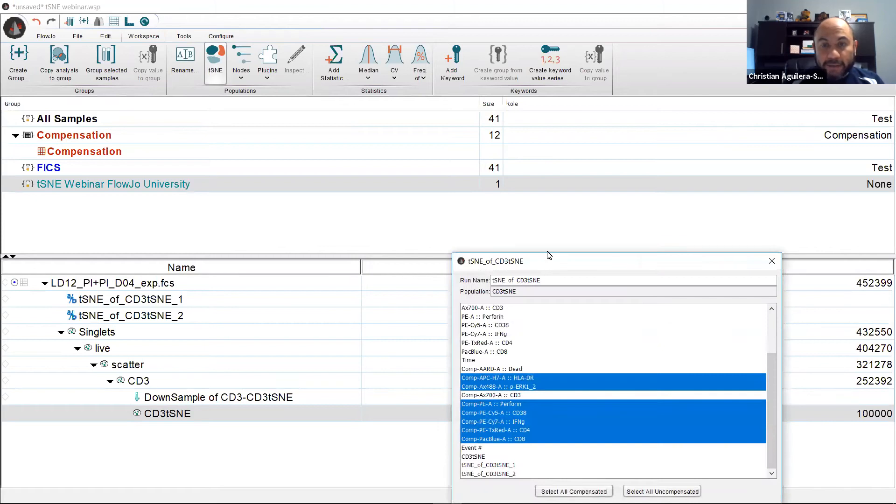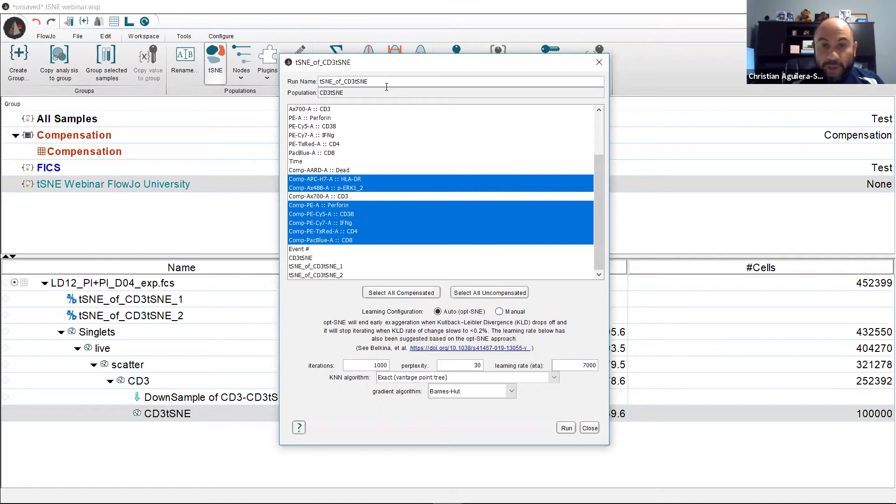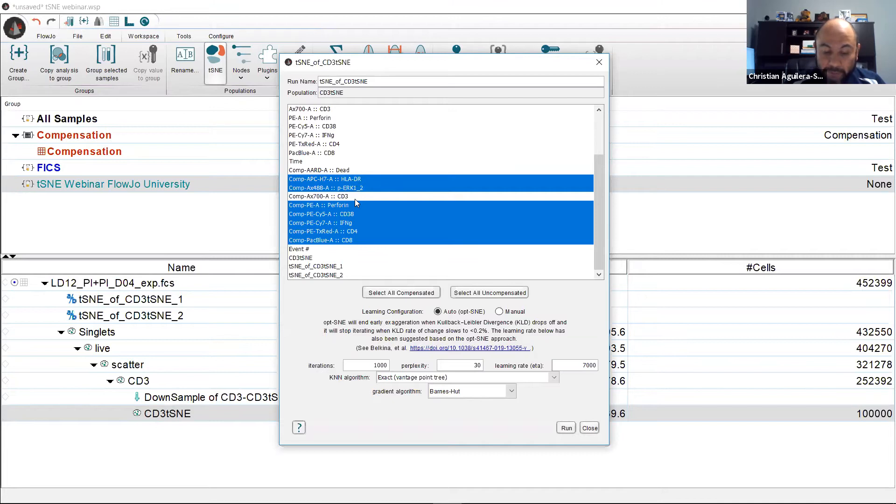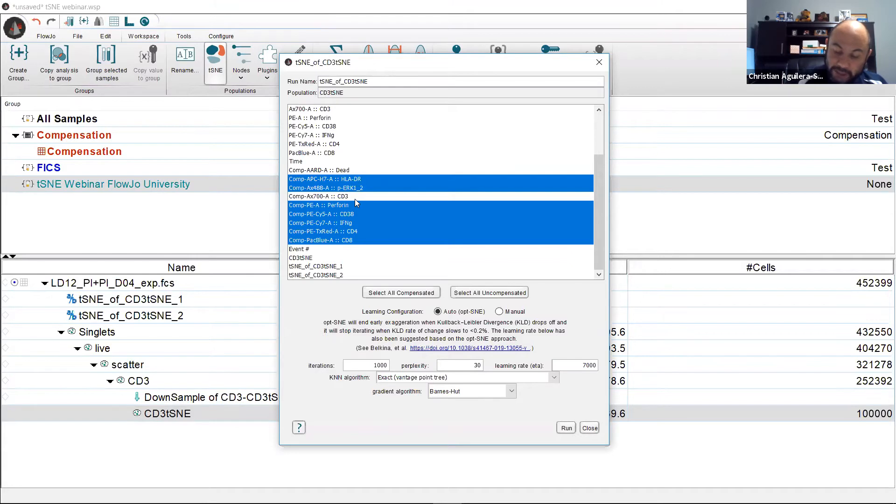Next we select the compensated parameters of interest. Note in this case I did not select viability or CD3 parameter and that's because I'm already working on cells that are viable and CD3 positive, thus eliminating the need to check for viability and CD3 heterogeneity.